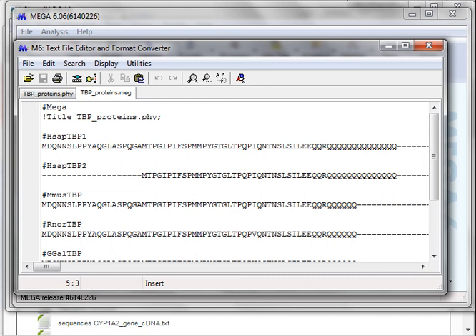We will select our sequences from desktop, the TBP protein. Now a MEGA file. And we have to say which sequences are. We are not using nucleotide sequences, neither pairwise distance. We are using protein sequences. And you say OK. It computes. And it asks you once again to select. The statistical method is neighbor joining as you chose.